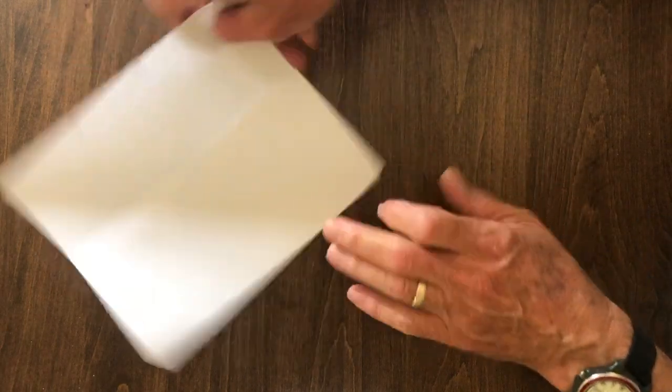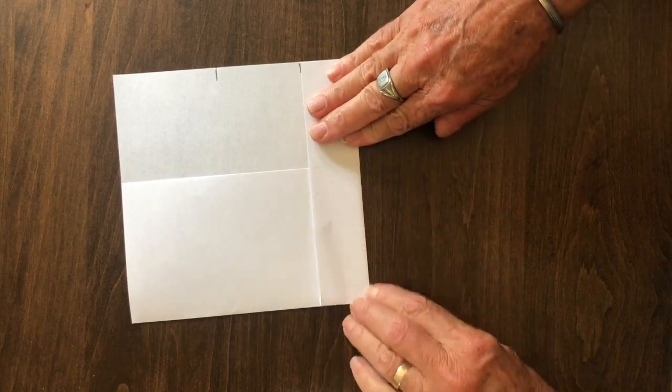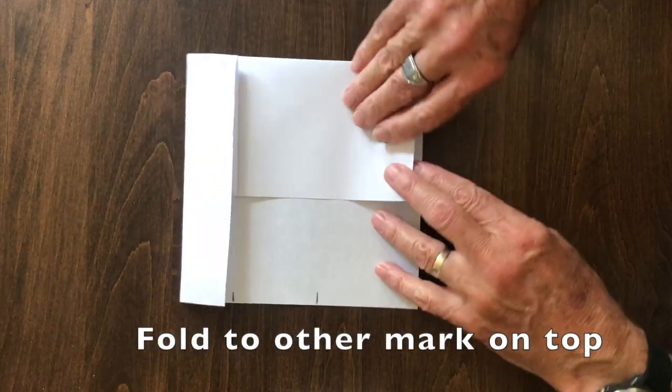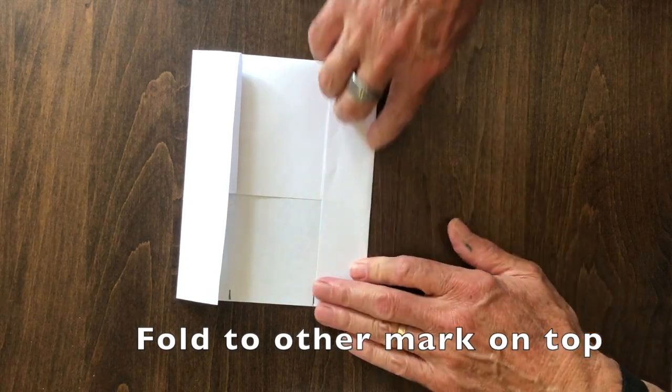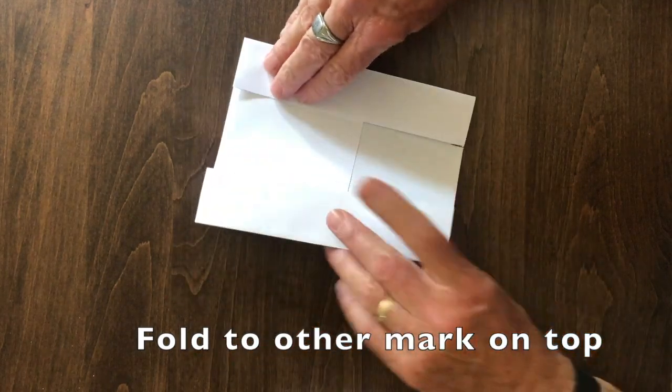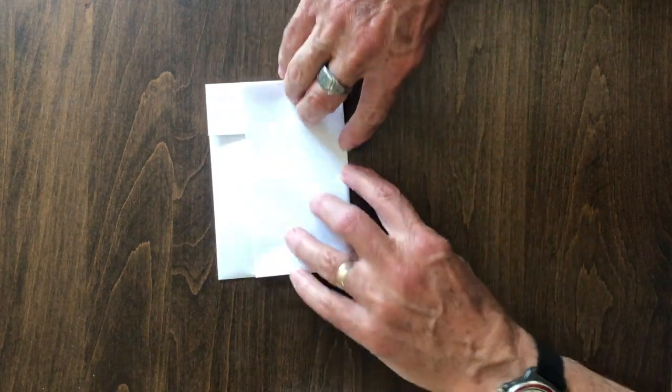Fold one edge in up to the mark on the top, and then turn it over and fold the other edge in to the other mark at the top, and our packet is almost ready.